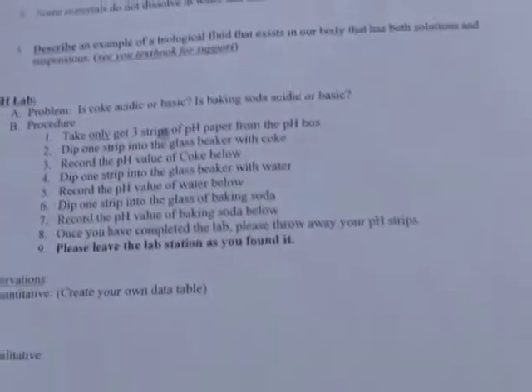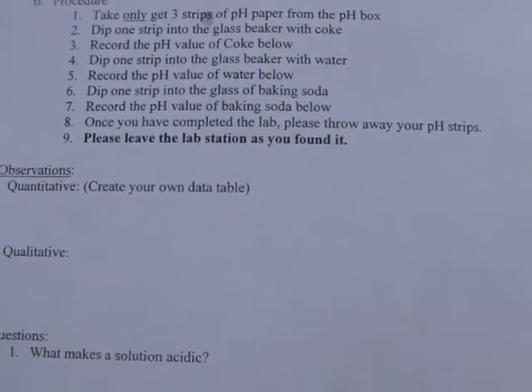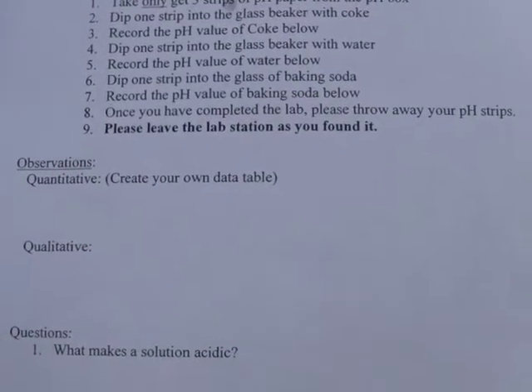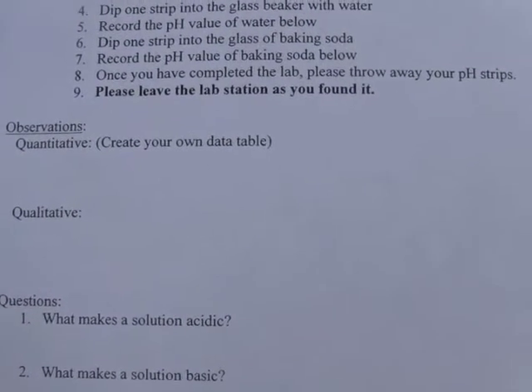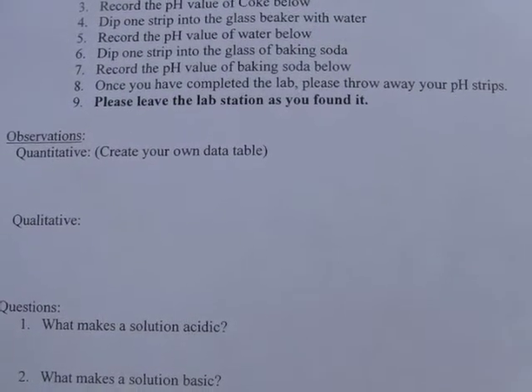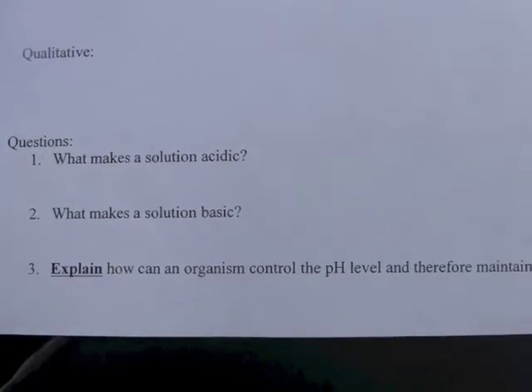Okay, so going back to your lab, the pH lab part C, you would want to collect both quantitative, so you'd record the pH level, the qualitative data, so the colors in which you're seeing with the different pH levels, and then finally there are 3 questions to answer regarding pH.